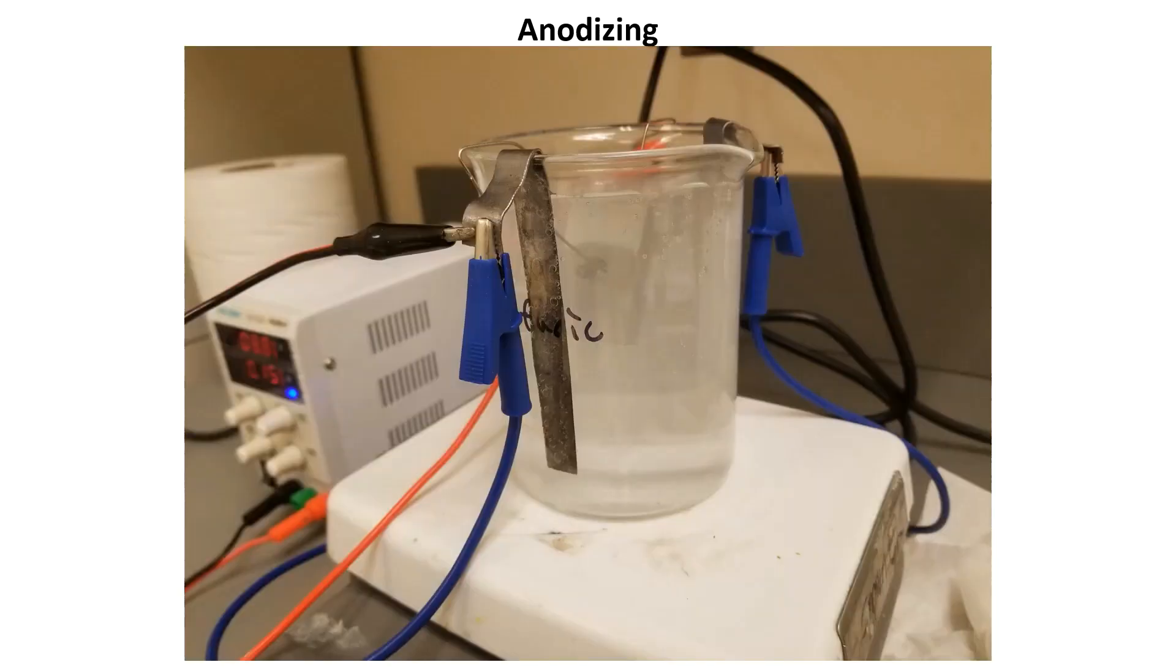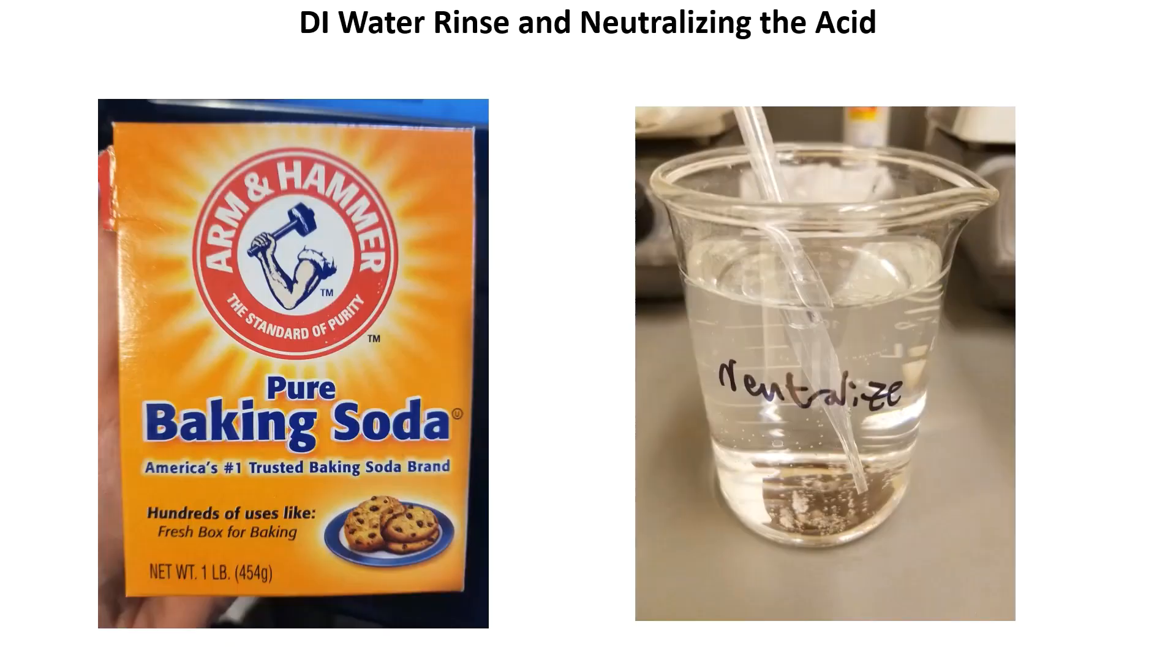With the current set, I let the anodizing run for 90 minutes as specified in the Caswell guide. The sulfuric acid solution was at room temperature and I used a magnetic stir bar to agitate it. The agitation is needed to circulate the electrolyte but also knock off the bubbles that form on the surface of the anode and cathode that would impede the reaction. The positive connection is attached to the anode workpiece and the negative is connected to the cathode plates. I attached my cathode plates in parallel with a jumper. This is opposite of electroplating where the workpiece is generally the cathode.